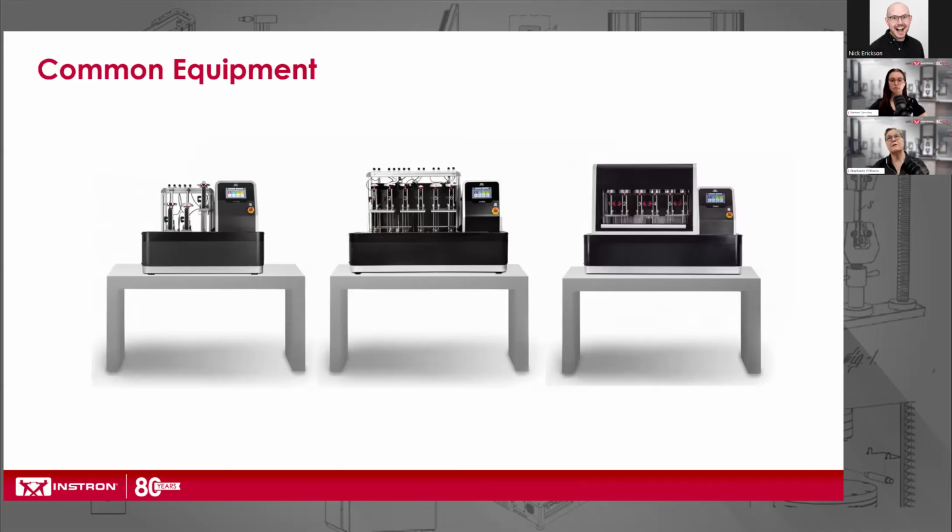Common equipment: the standard practice in these tests is you should be running at least two tests because you're looking for an average. You're looking to average these values to get the result you're going to report. So standard is to run two.